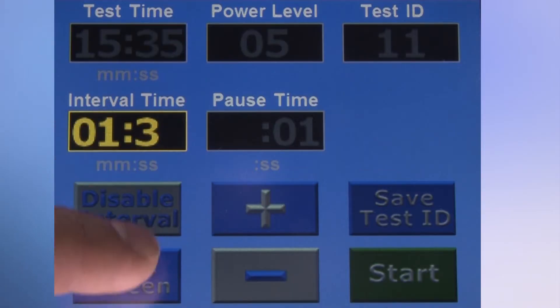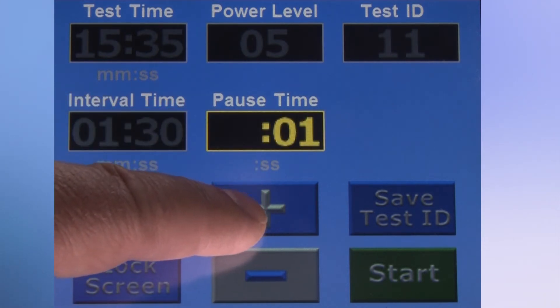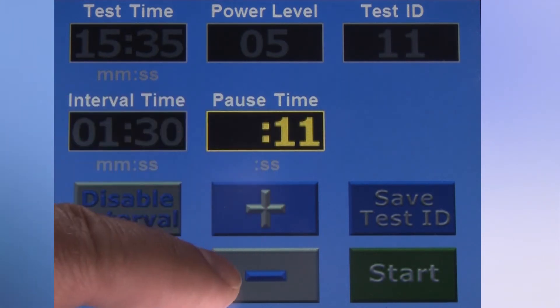This interval pause feature is fully customizable as to the length of pause time, as well as the number of pauses during the test.